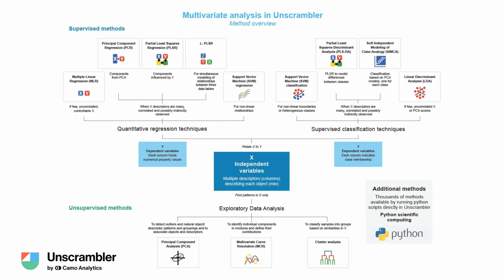There are not very many methods, as you see, and that is on purpose, because these methods are, after all, intended for domain experts and good methods. We have some methods for traditional statistics to cover those aspects. We have some for non-linear data, non-linear problems. And then we have the bulk of methods.